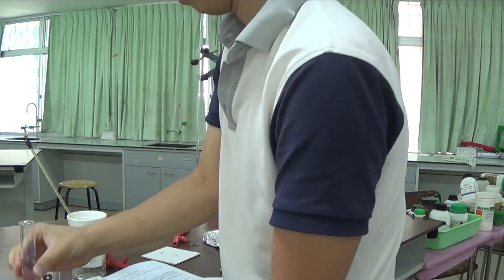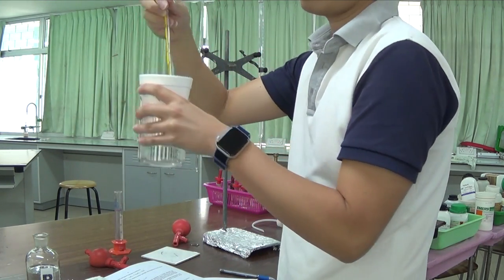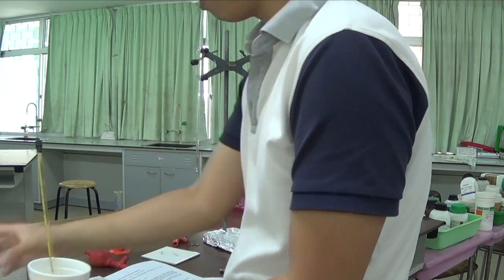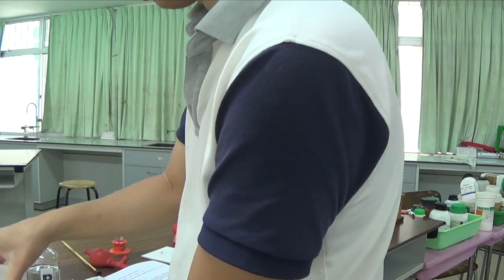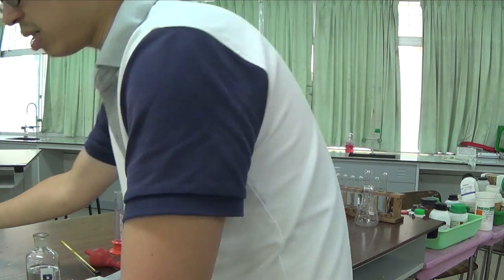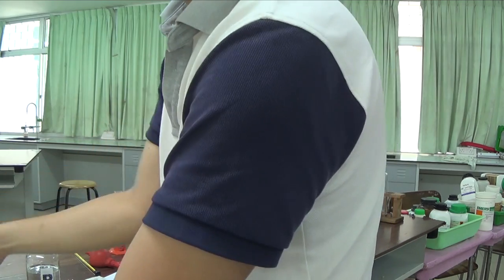End, that one is done. And I forgot that I should rinse this out before. Okay, anyway, it's not too late to do it now. So what I do then is just throw this away. Rinse this with water, or distilled water.